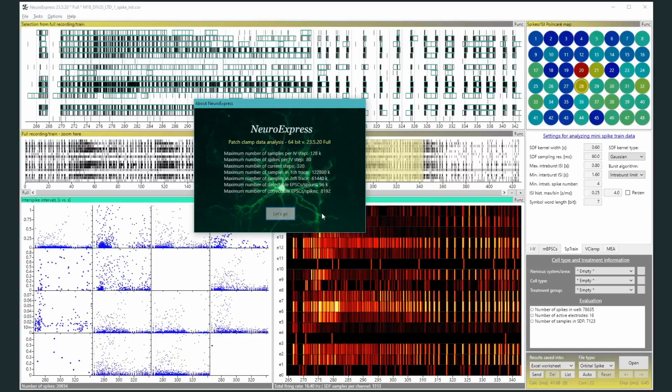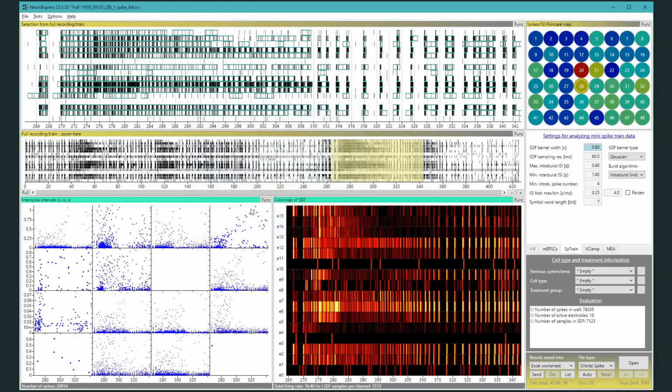Welcome to this next part of the NeuroExpress tutorial. Here I would like to demonstrate the spike train analysis module of the program. For those who are not yet familiar with NeuroExpress, let me just give a brief introduction.